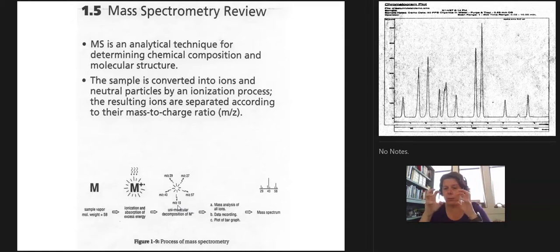Say you had a methyl group on your compound. When it gets into the mass spec, it excites it and breaks it up into pieces. How it gets broken up into all these different pieces is very distinctive for that particular compound.